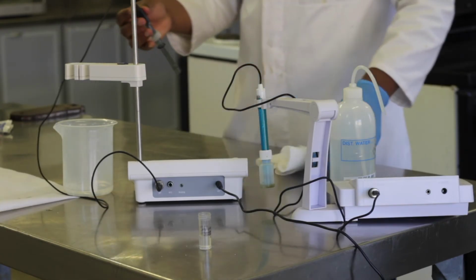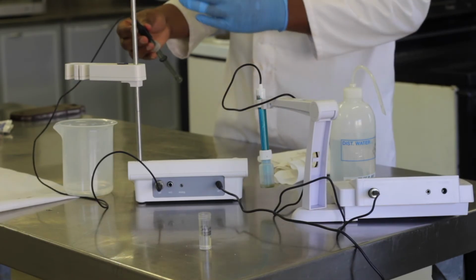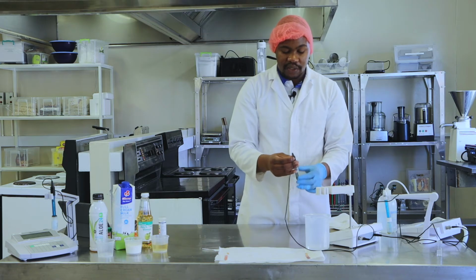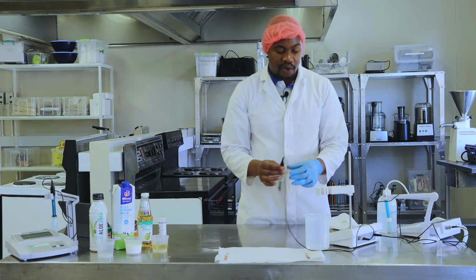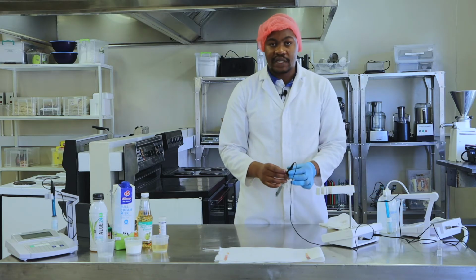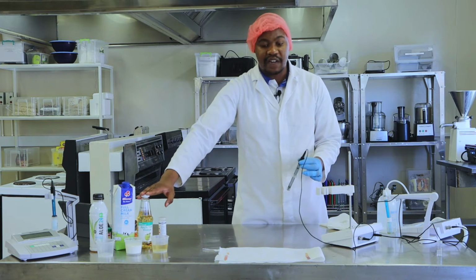So it's very important to wash your pH meter each and every time you're going to measure the pH and in between your samples, because you don't want to contaminate your samples or get an incorrect reading. So here I'm going to start with, for example, the first solution, my apple cider vinegar.